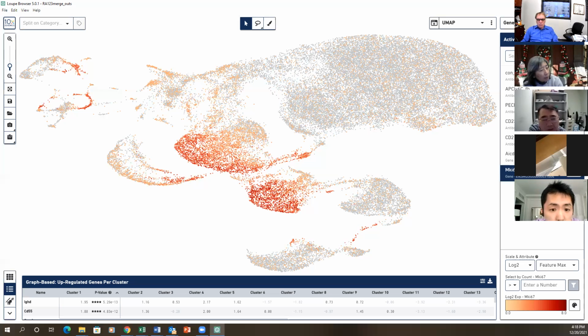Because we have 3 groups, every time we look at the germinal center, we compare knockout and wild type, and then we have a list of genes. And for the 3 groups, we see what is the common one. Then we look at common, I don't see common. I think we need to remove those immunoglobulin genes first, because I looked at your list, and there are lots of IgHV genes. So let's remove those. Otherwise, they're going to confuse the result.